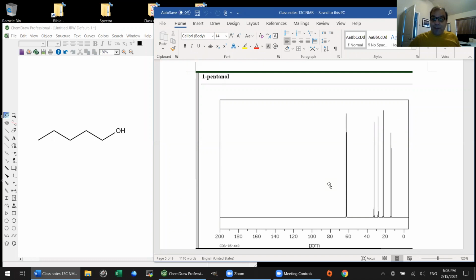In terms of the chemical shifts, very roughly speaking, the more electron density is around the carbon nucleus, or the more electron density is, as they call it, shielding that nucleus, the further towards the right the peak will be. We call this end the shielded end, or the upfield end of the spectrum. And so the more electron density is shielding our carbon-13 nucleus, the more upfield it is.